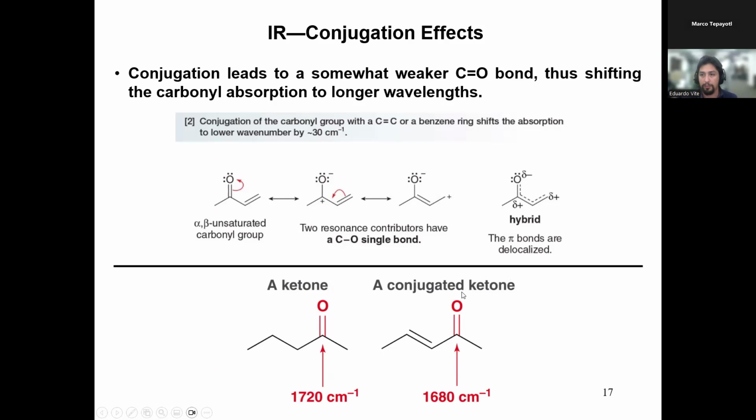And this is what I was trying to tell you. The carbonyl might be a ketone carbonyl, but depending on what's around it, that might change the wave number. So make sure you keep that in mind. You don't just keep it in your head that it's one number only and nothing else. You have to take a look at the entire molecule. Does this make sense? Are we okay?